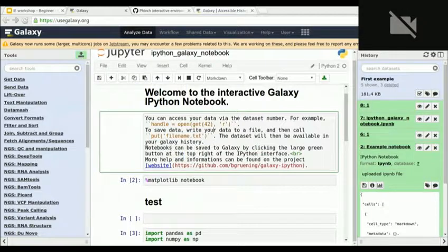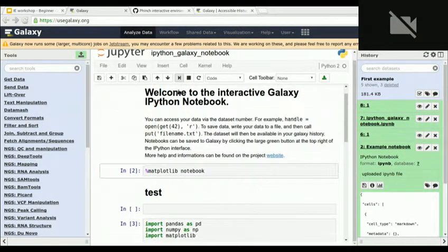But if you see here, now it's just plain text, it's annotated as markdown, so you always need to execute the cell. Execution means play, and then it will render your annotation.